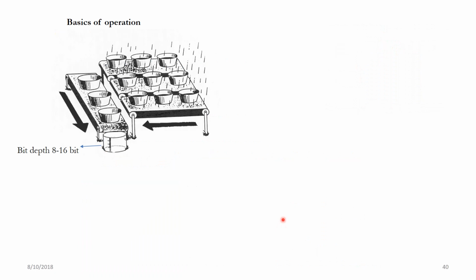So this is a very beautiful analogy for how the EMCCD works. Imagine these raindrops to be the photons which are collecting in these buckets. Each bucket is a pixel, and then once the collection is done, using a conveyor belt, it is poured into these buckets again, and one after another they are poured and measured in this measuring cylinder.